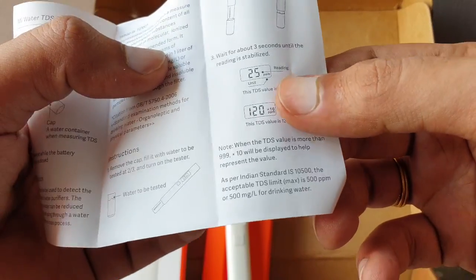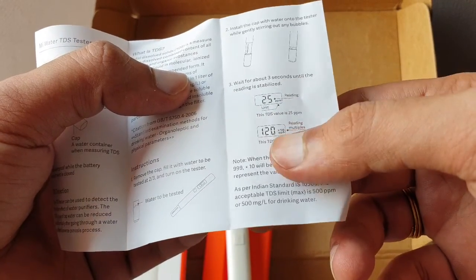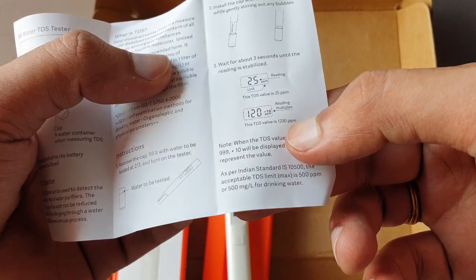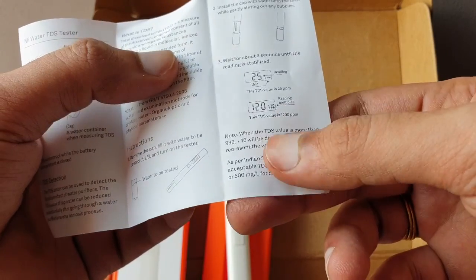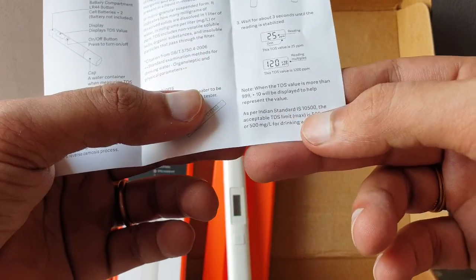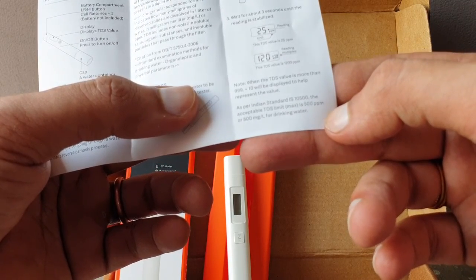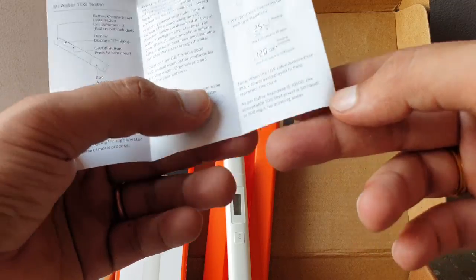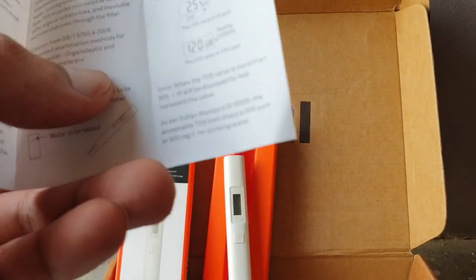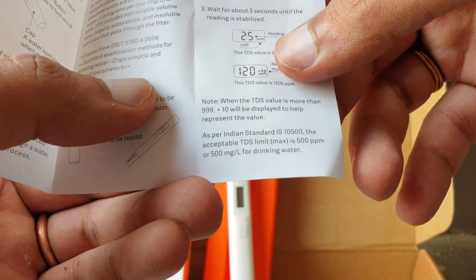If the reading says 25 ppm, the TDS value is 25 ppm. If it says 120 with an 'x10' indicator, then the TDS value is 1200 ppm. When TDS is more than 999, 'x10' will be displayed. As per Indian Standard, the acceptable maximum TDS limit for drinking water is 500 ppm. After 500 ppm, the water is considered unsafe to drink.